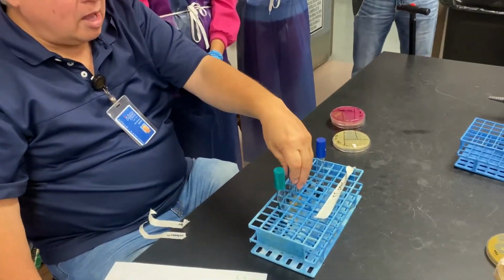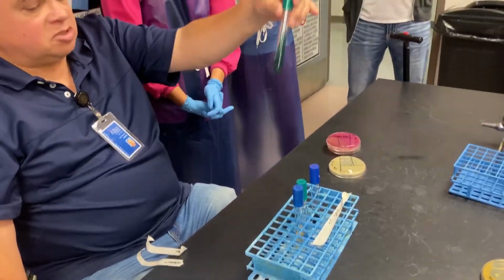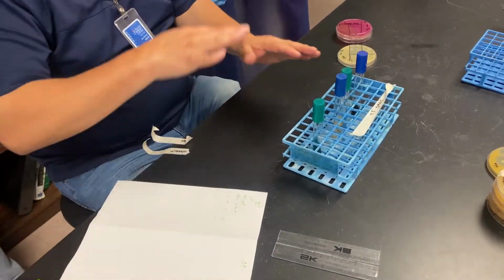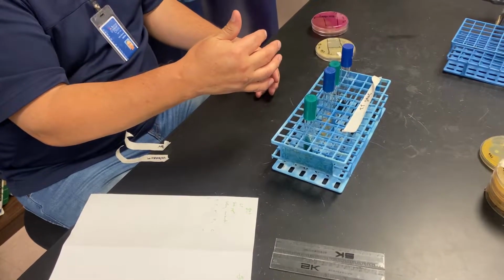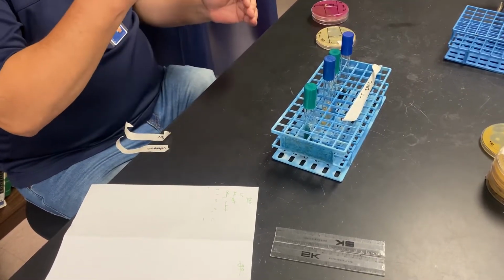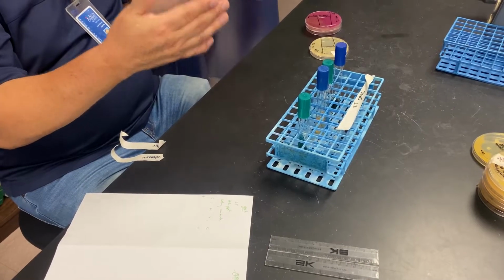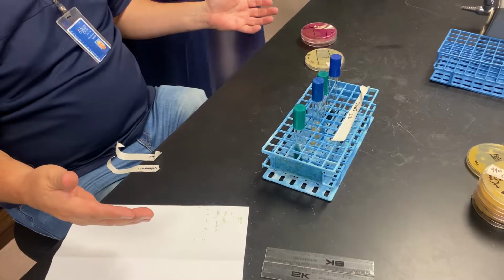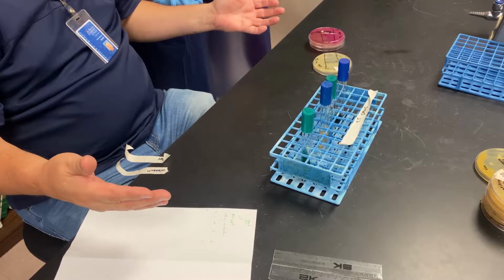I don't know my MR-VP, but we're going to add the reagents there, right? And Kovac's is over there. And then my citrate is negative, right? So that's all the information that I have right now. I would have to do the rest of the tests, add the reagents, to figure out what those others are. Once you figure that out, then you can start to really differentiate what's on that particular handout. So you'll look at lactose fermenters, and then from there, I have an H2S positive. I'm going to look for the one that's H2S positive. If I find one that's H2S positive, that's the one I'm going to target.